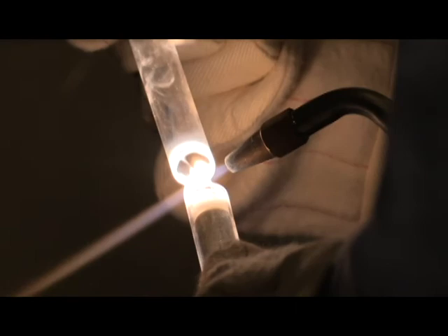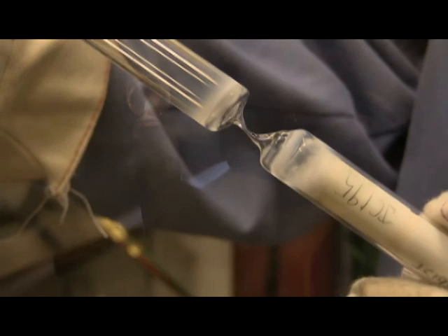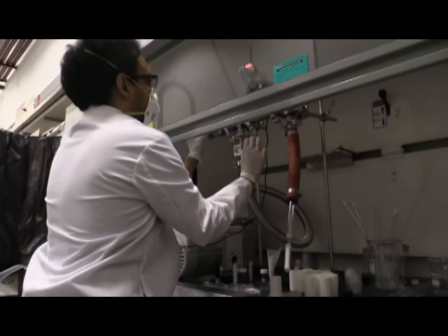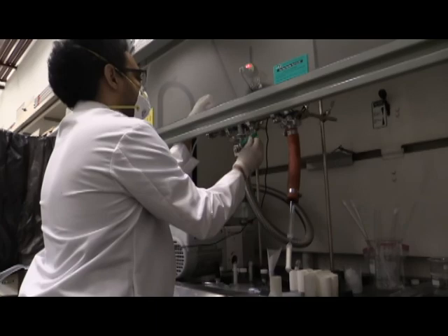This small opening allows us to evacuate all of the air out of the tube and then rapidly seal the tube so that our crystal is grown in a very low oxygen environment. This is essential because many elements react strongly with oxygen, especially at high temperatures.